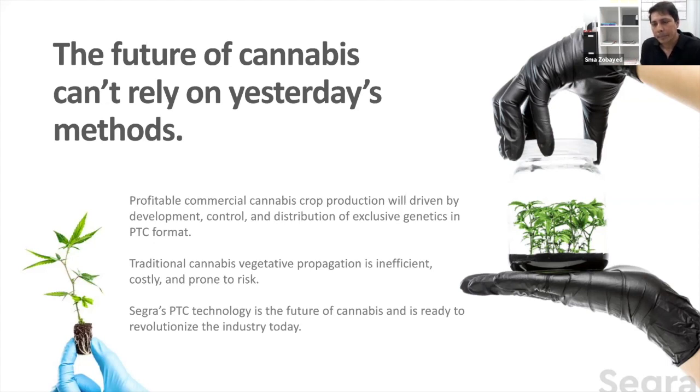Awesome, thank you. We've had a couple of questions about clonal variation, so I'll combine them into a two-parter. To start off, how do you identify clonal variation if it does occur? Do you have to flower the plant directly, or is there an easier way to screen it earlier? Yeah, the easiest way to screen earlier is DNA fingerprinting, which we are doing.